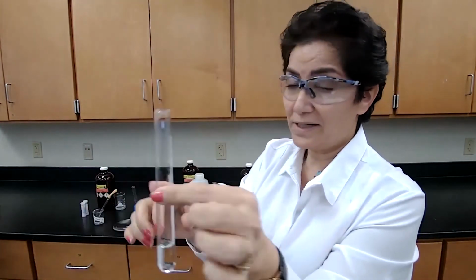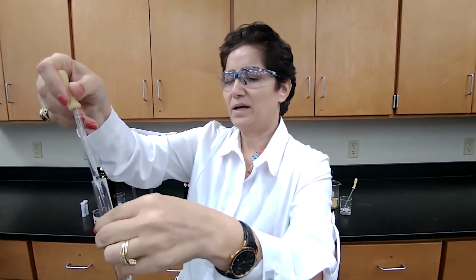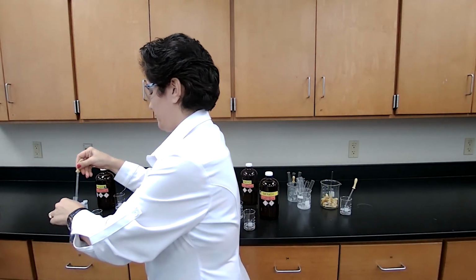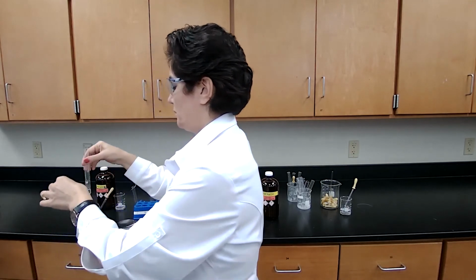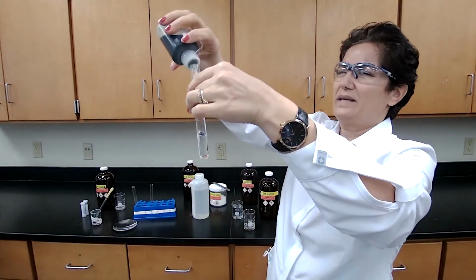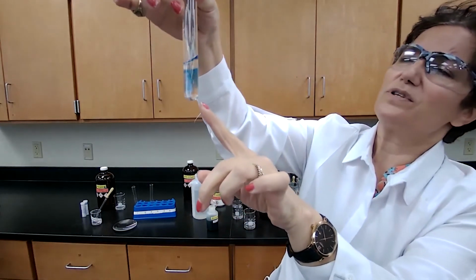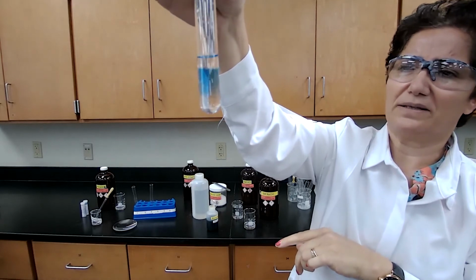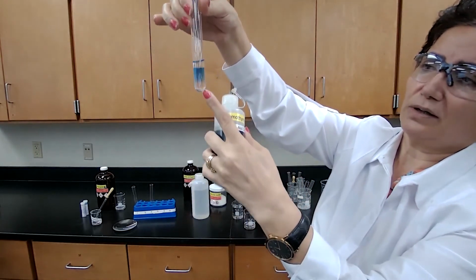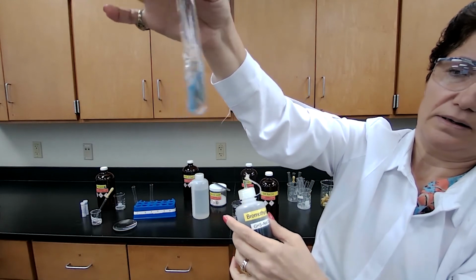For the sodium hydroxide, this test tube is the sodium hydroxide with the unknown. So I would add the unknown to the sodium hydroxide. Add some color here. When I add this, which I could have added before too, it might make it easier for you to see the layers. See, like the blue color, because the bromothymol blue is blue color in sodium hydroxide, and then we have that layer of the unknown.